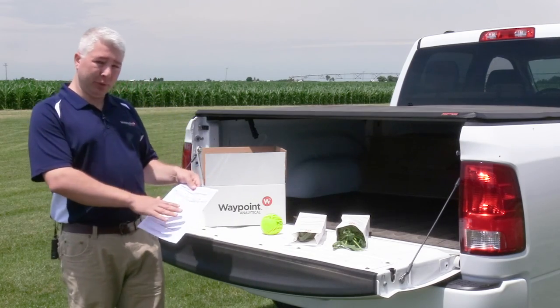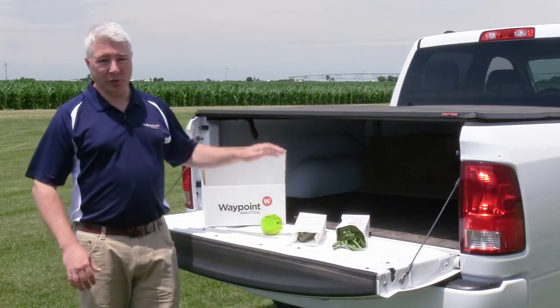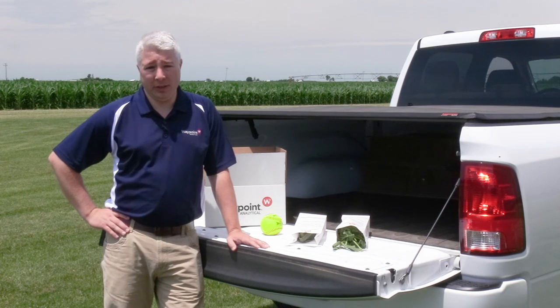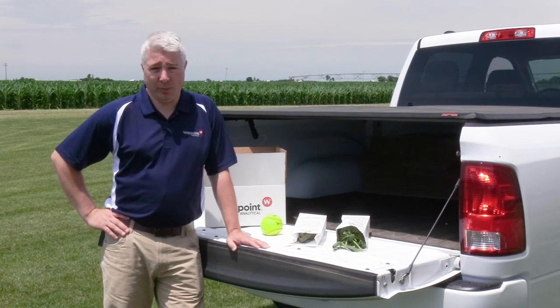So after all that is completed, you'll put your samples and your paperwork in the box and ship it to your nearest Waypoint lab. You can find your nearest lab as well as other information on tissue sampling and other agronomy tips at our website, www.waypointanalytical.com.